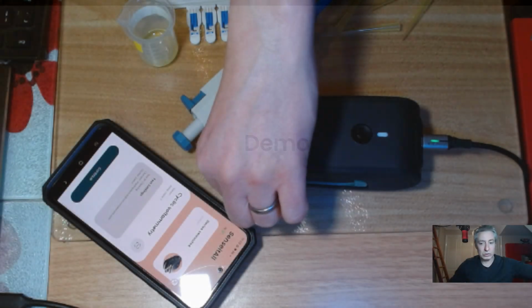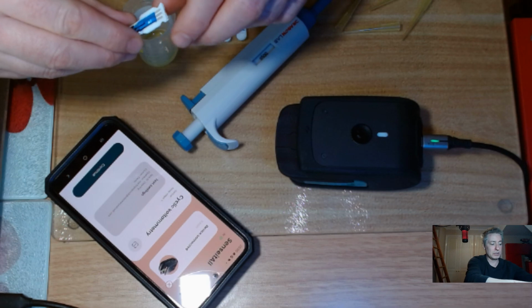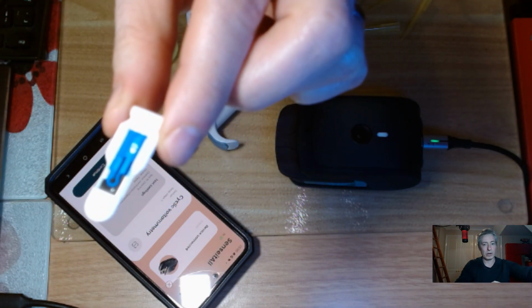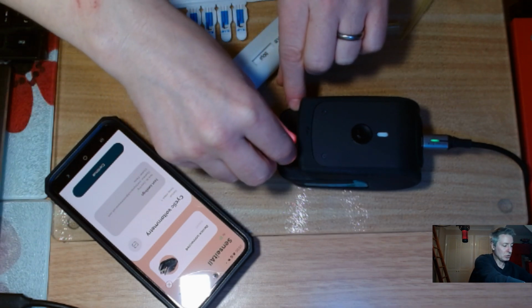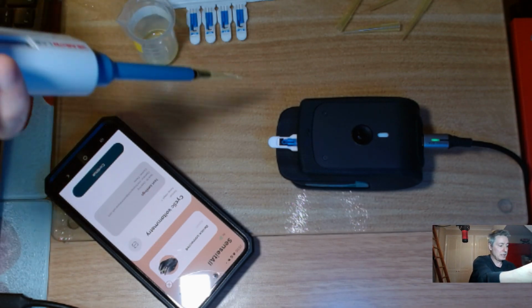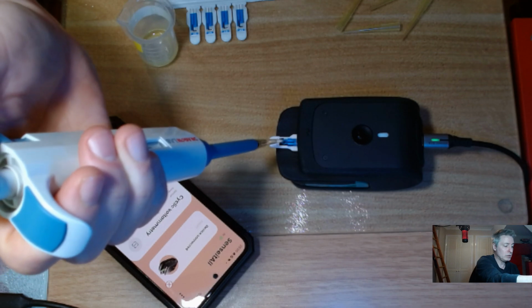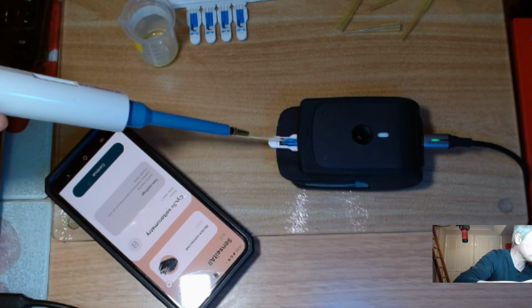So let me just go to here. Something that's not talked about too much online: I'm going to use a carbon circular electrode called a 501 from ZP. I'm going to clean this electrode with a pH 2 sulfuric acid solution. Nothing special or fancy.